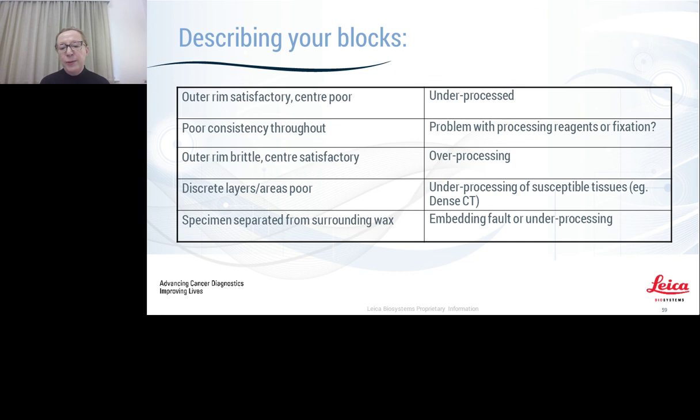Specimen separated from surrounding wax. Could it be an embedding fault or is it underprocessing?